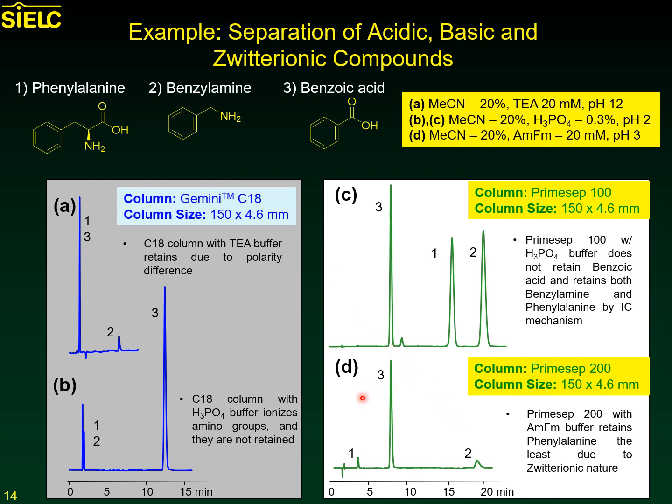And the benzoic acid will maintain the same retention time as it did in the previous experiment, as the same reverse phase mechanism is retaining it on the column.